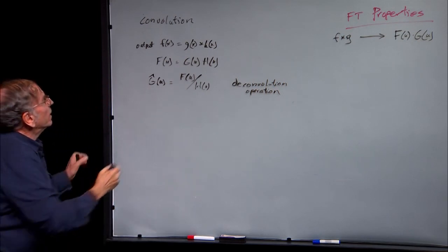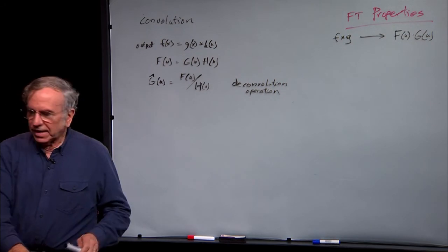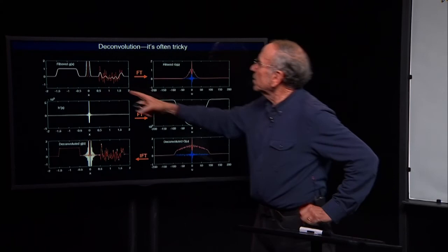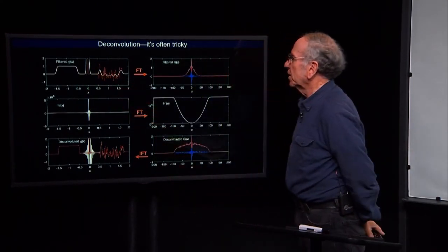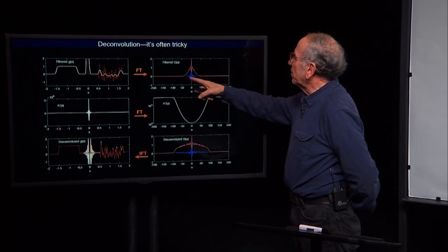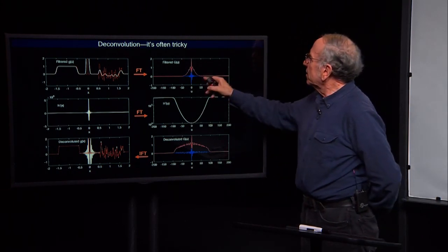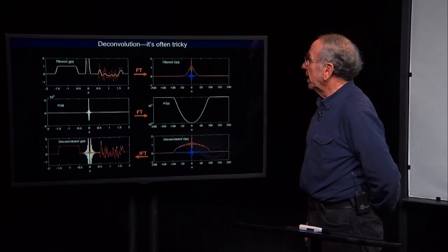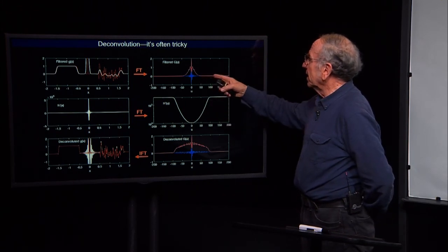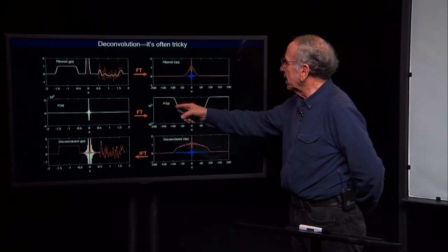And this is very exciting. If we can do deconvolution, then we can do things like sharpen microscope images and so on. So let's try to do the deconvolution. So we start out with this filtered g of x, and we take its Fourier transform, and there it is. And we see what we saw before. At high frequencies, g of u is all 0. Now, to recover, we want to divide by h of u. So here is the reciprocal of h of u. I call it h prime of u.